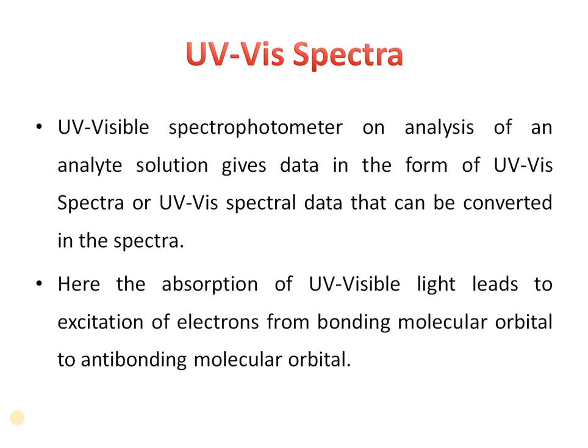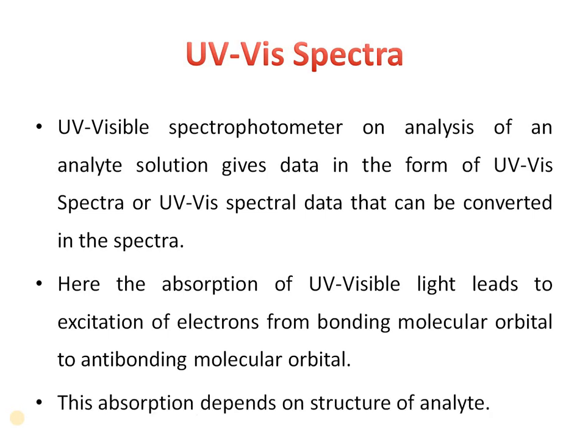Here, the absorption of UV visible light leads to excitation of electrons from bonding molecular orbital to anti-bonding molecular orbital. This absorption depends on the structure of the analyte.